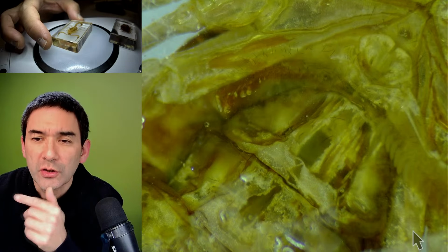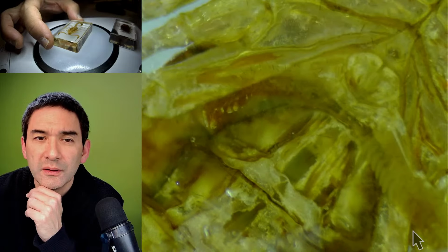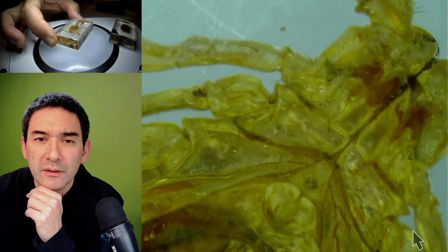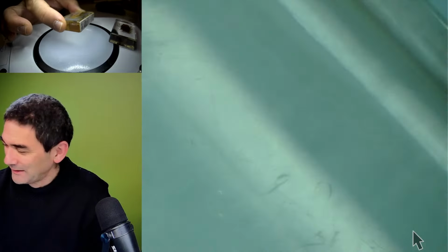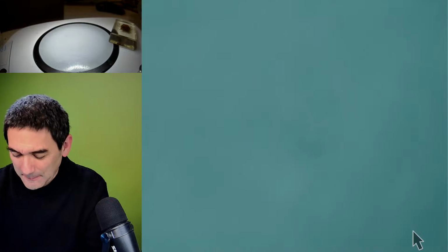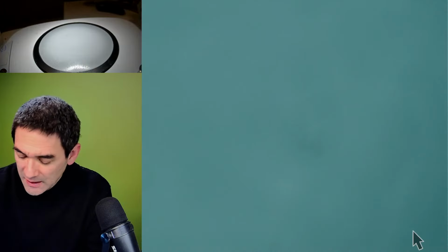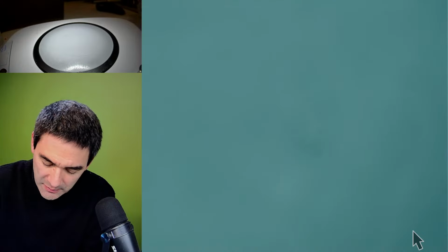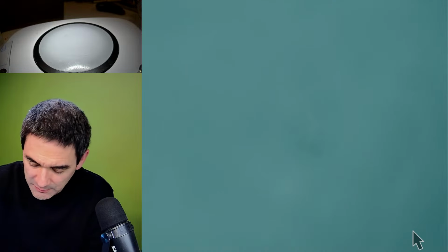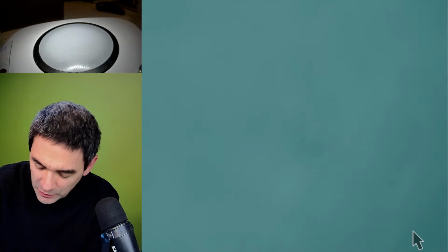I'm occasionally also reading a little bit of the comments here. Okay, I think you get the idea. And now, last thing, I have to wipe it clean again, so I'm going to do that. And I'm checking the time, 41 minutes, because I do have a few other things I want to show you. But that's, again, as I said before, a little bit on my list.